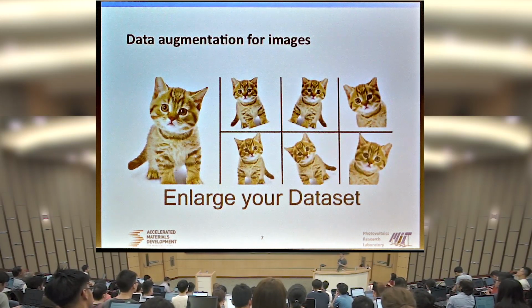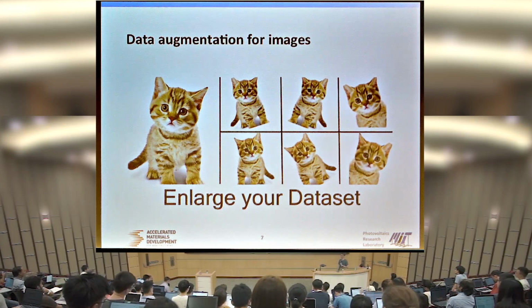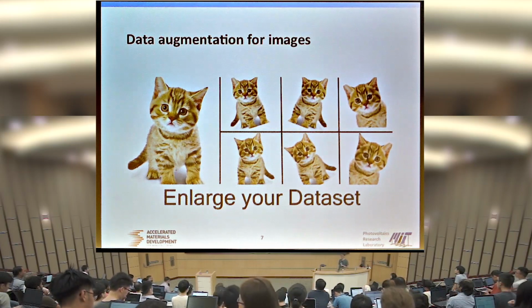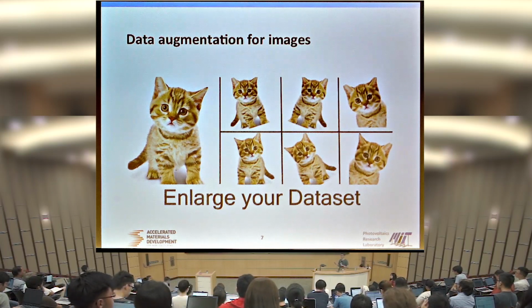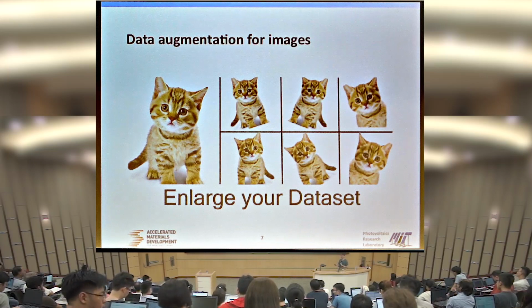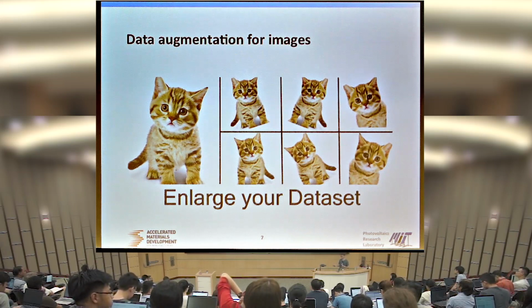Okay, so our method starts with data augmentation. Why do we need data augmentation? Because when we are synthesizing materials, our data points are expensive. You cannot say I will synthesize 2,000 compounds and then use that to train on the XRD spectra, because it simply does not make sense. For this study, we have around 70 experimentally synthesized compounds. This already took months to prepare this data set. But 70 spectra is still not sufficient to train our algorithm, we found out.